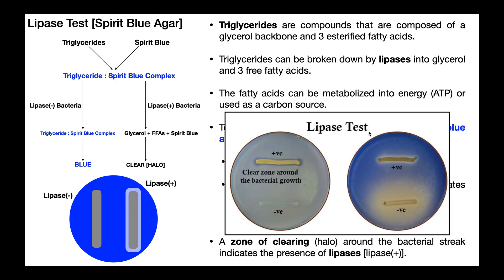Here's another look at the lipase test. This one on the right is specifically the Spirit Blue agar. The top streak is the positive lipase species — you can see there is a clear zone of clearing or halo around that streak. The negative one below it is cloudy around the streak due to some growth, but there is no halo. Over on the left, this is another type of agar that can be used to test for lipases — it just doesn't have the indicator. Even so, the positive species on the top has a visible halo, and the negative species on the bottom has no halo. In either case, if you see that halo, you know you have a positive lipase organism.